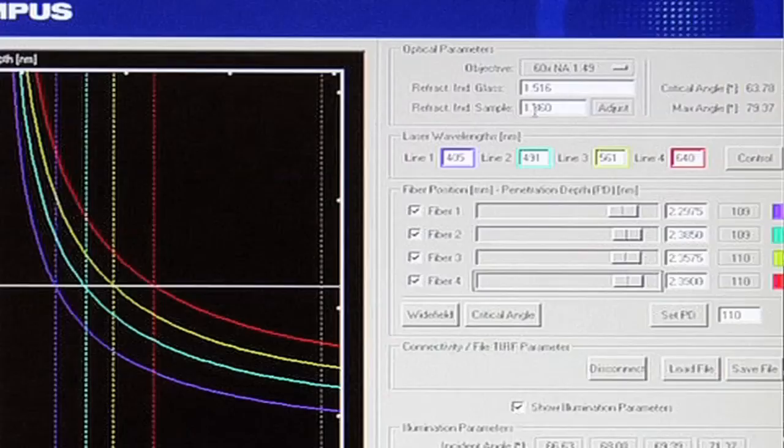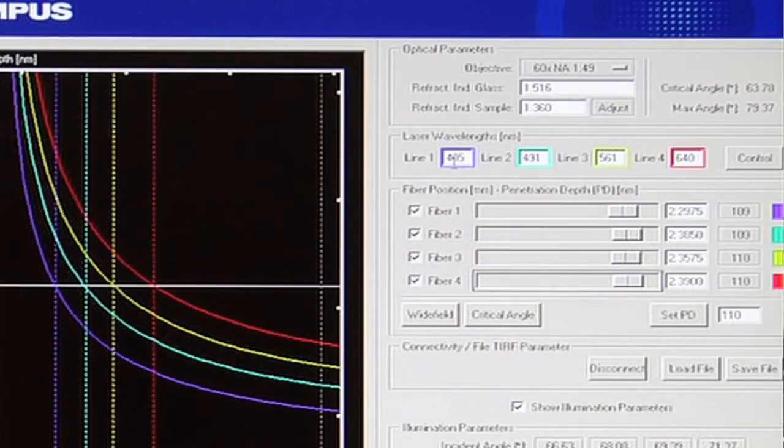Each of the curves that you can see come in there are for the specific wavelengths that we're using. So the system is set up for four different wavelengths, 405, 491, 561, and 640. So they're color coded there with the curve on the left hand side being the 405 moving towards the 640 on the right hand side. And this actually represents what I was saying earlier, how critical it is to have different incident angles for different wavelengths. And that's really what this graph is showing.